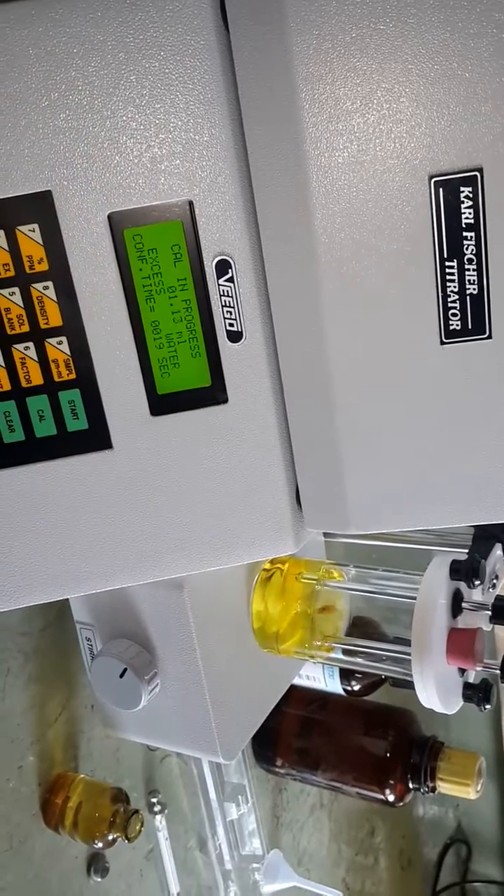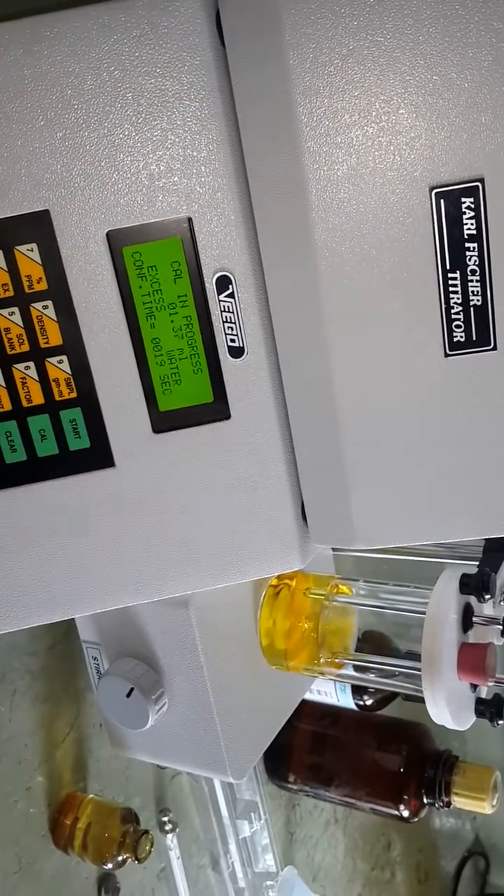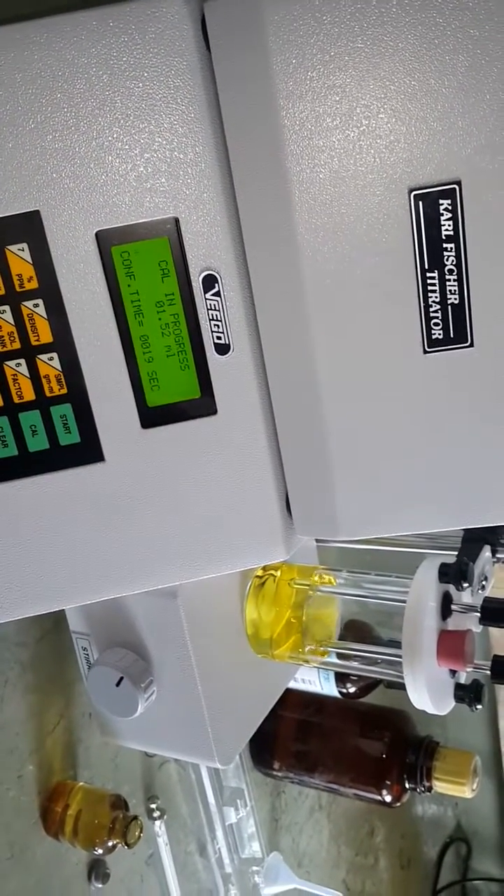The titration repeats. Initially the reagent is added very fast; as it approaches the endpoint, the addition of the reagent becomes very slow.